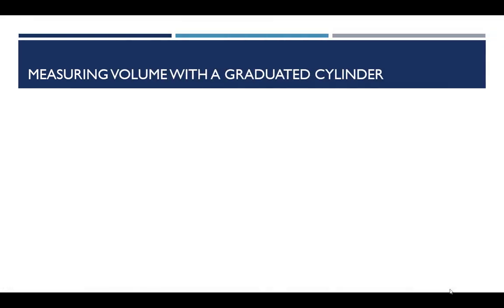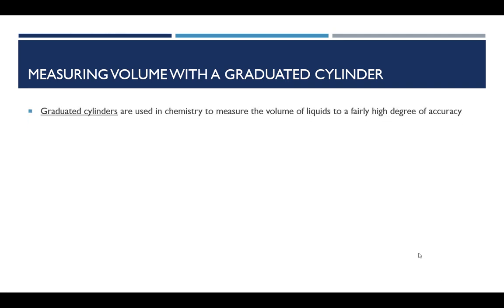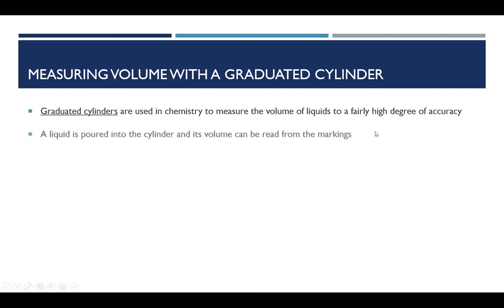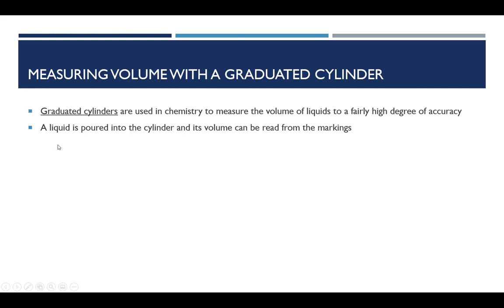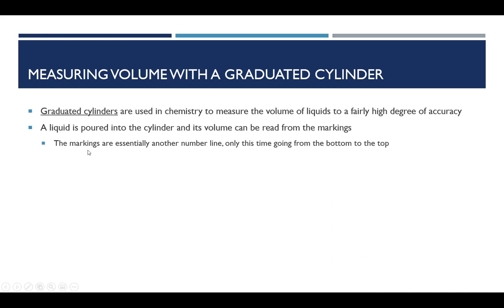Now we turn our attention to measuring volume. The principal device we are going to use to measure volume is called the graduated cylinder. It does a reasonably good job of measuring the volume of liquids — not to the highest accuracy achievable, but to a level that's very good for most of what we want to do. To measure the volume of a liquid, we simply pour it into a graduated cylinder. The graduations — that's why it gets the name graduated — are the markings on the side, and we can read those markings to figure out the volumes.